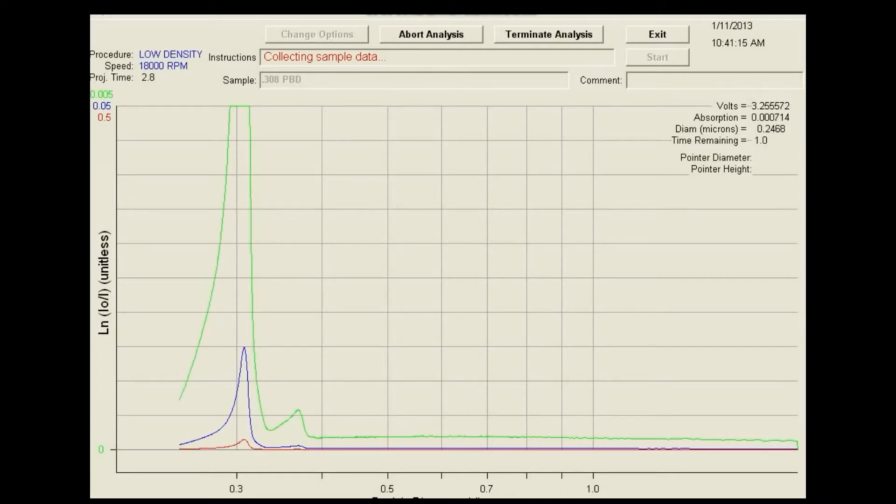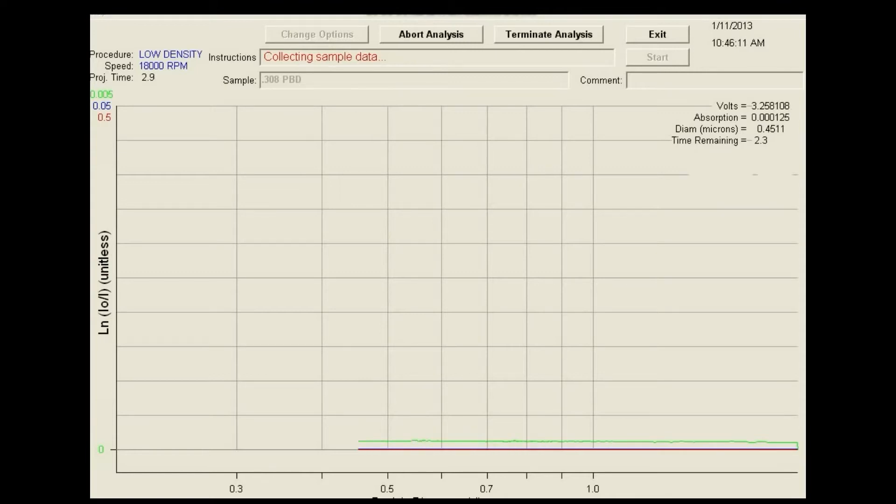The CPS disc centrifuge allows the measurement of highly polydispersed particles within an approximate size range of 3 nanometers to 60 microns depending on particle density. The CPS can measure particles with as little as 2% size difference from one another.